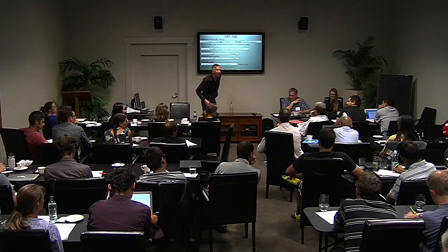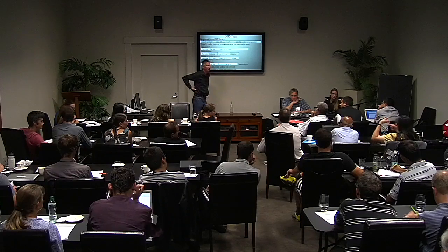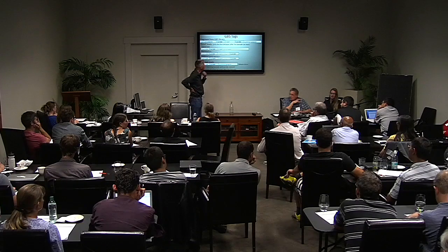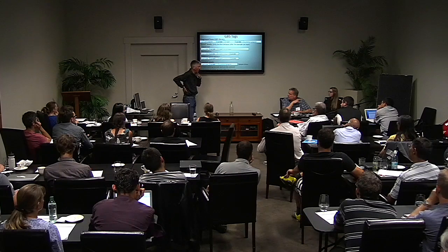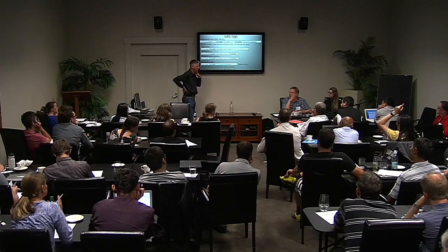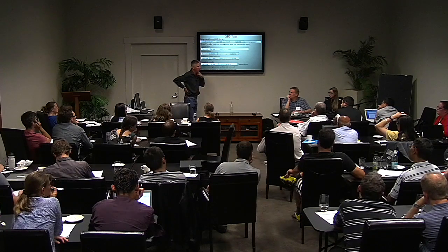You're only reading 64 bases, and the chances of having two are pretty low. It depends on your fragment sizes. Generally, actually having it happen, I think it is pretty low. What do you think? In maize, about 20% of the tags that we get are less than 64 bases.